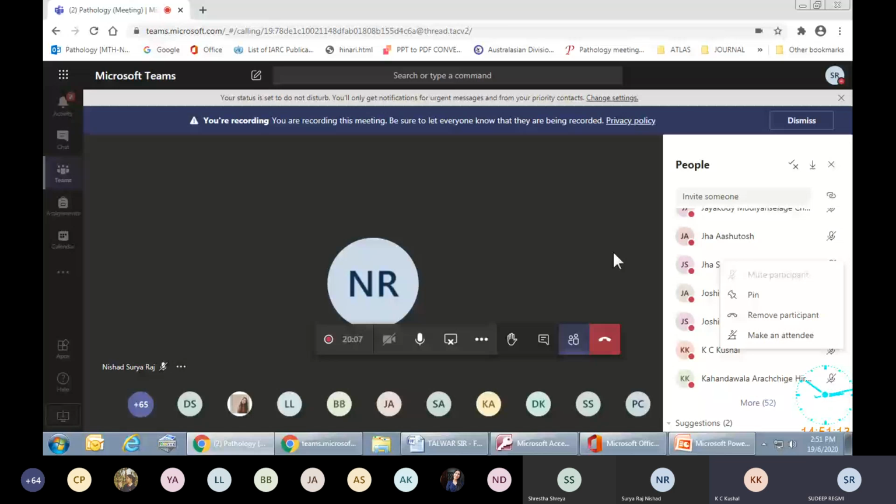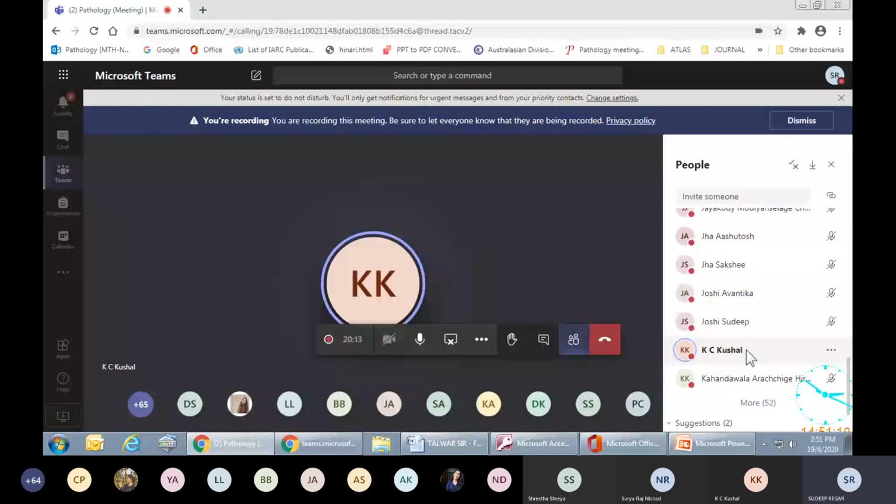Good afternoon, sir. Good afternoon. Can you please tell what are the differences between the proximal and distal type of carcinoma of the colon? So, in case of distal, the proximal portion is thinned out. Okay. Both have napkin ring formation, sir. Napkin ring formation is present in which? Not both types, in the distal one, sir. Okay, distal one. And what about the proximal one? In proximal, there is ulceroproliferative growth. Okay, very good.